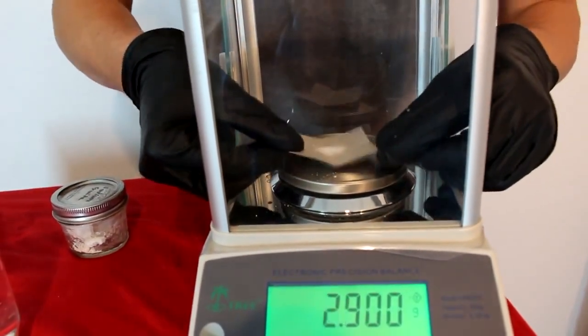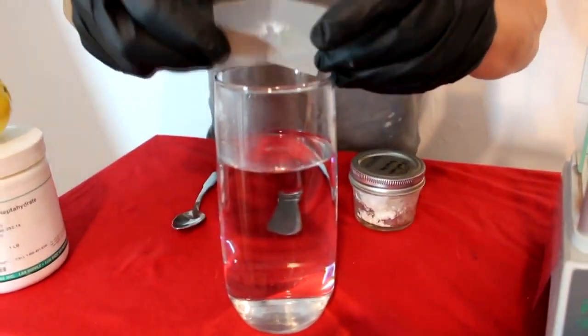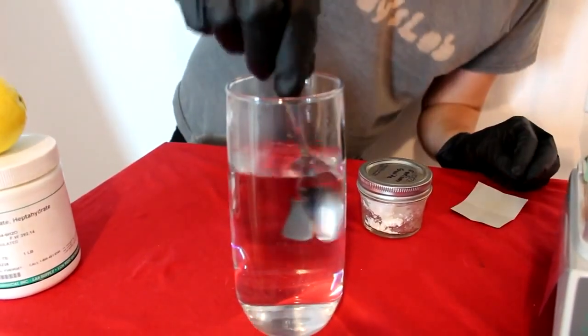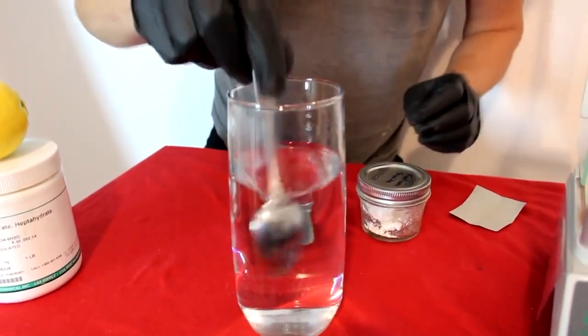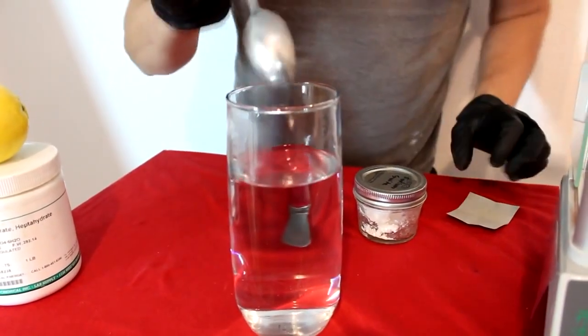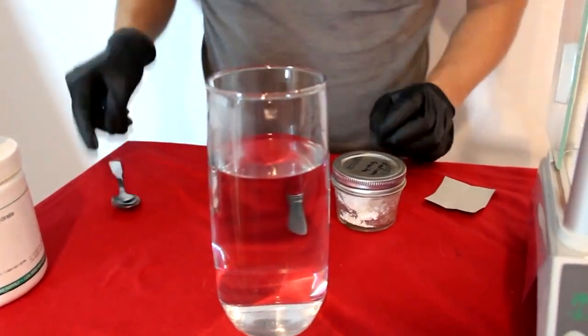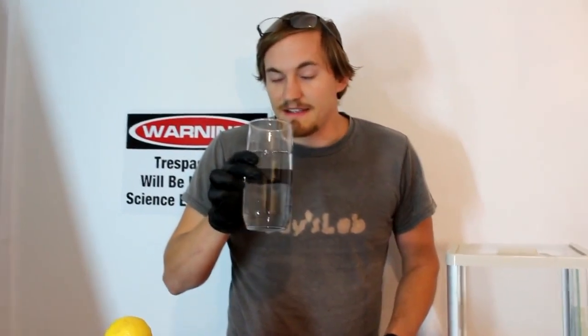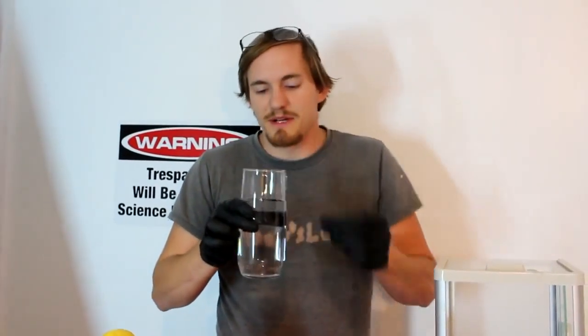So now I'm going to take this and bring it over here to this glass of water. I'm going to tip it in, just like this — a little thump, a little stir. And now I have a solution of sodium cyanide in water. Just enough to smell the fact that it does actually smell a bit like roasted almonds.